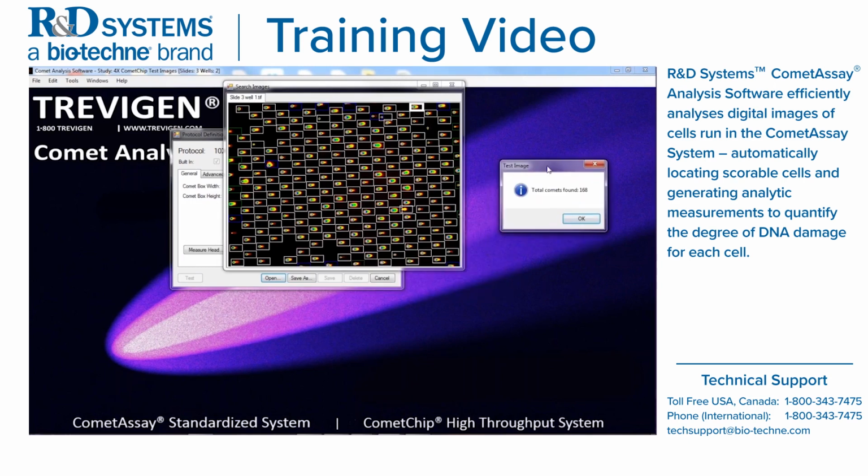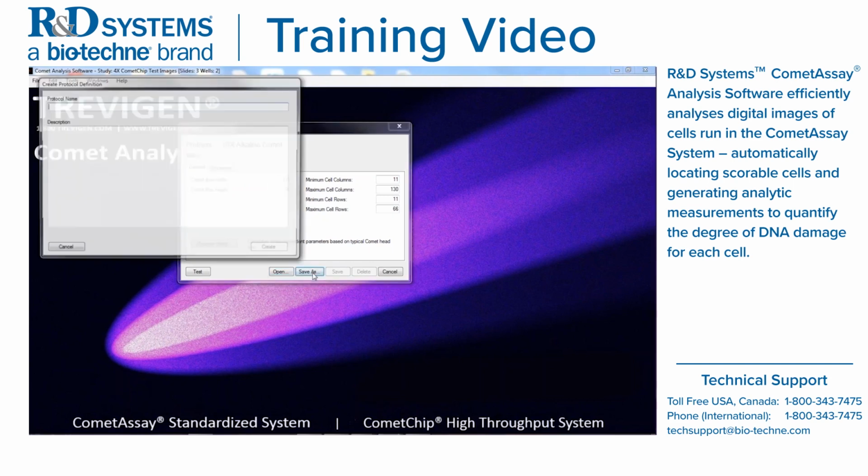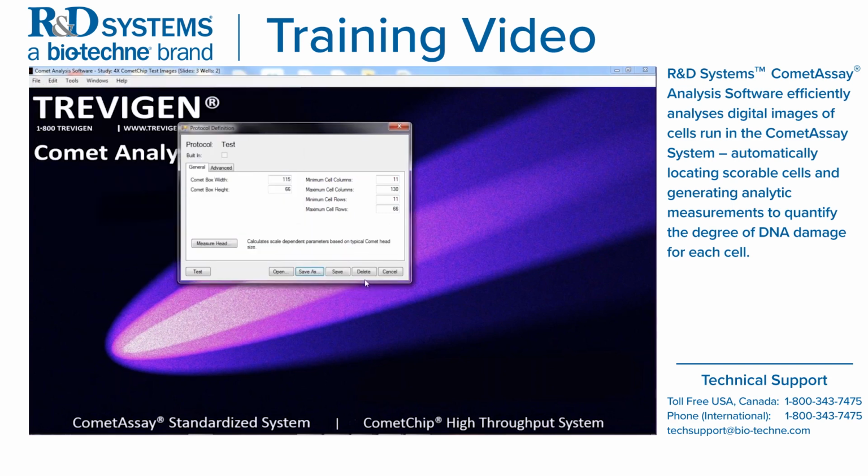So now we've just identified one more comet instead of 167, 168, but you can see that the box sizes are no longer overlapping. So we're going to say OK. Right, so we're not done yet. So see, we still have this name called 10X alkaline comet. This is a default protocol that you're working on. So now you have to hit Save As to save your new protocol. So let's call this protocol Test. And then we are going to create and select OK.